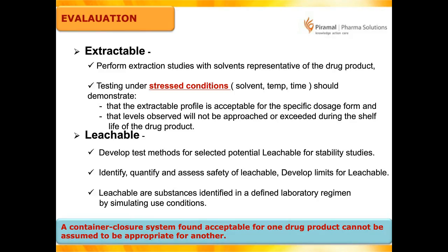Once you perform this stress condition study, the extractable profile is acceptable for the specific dosage form, and the levels observed will not be exceeded during the shelf life of the drug product. So you need to be very sensitive about the levels which you are getting, whether these are appropriate levels, and whether the techniques which you have employed to conduct your study are sensitive and the right techniques. All these things play a very important role while performing an extractable study.